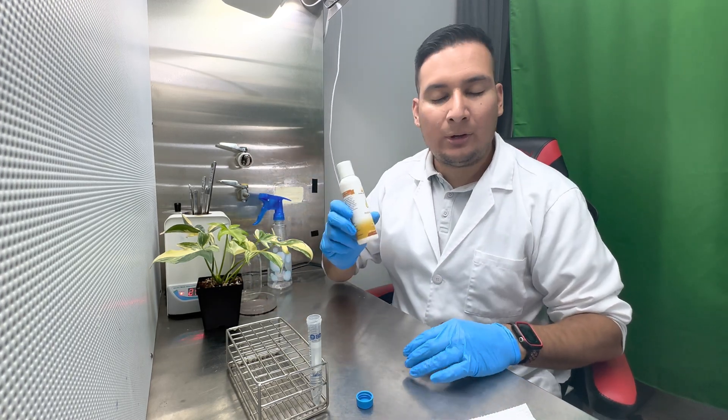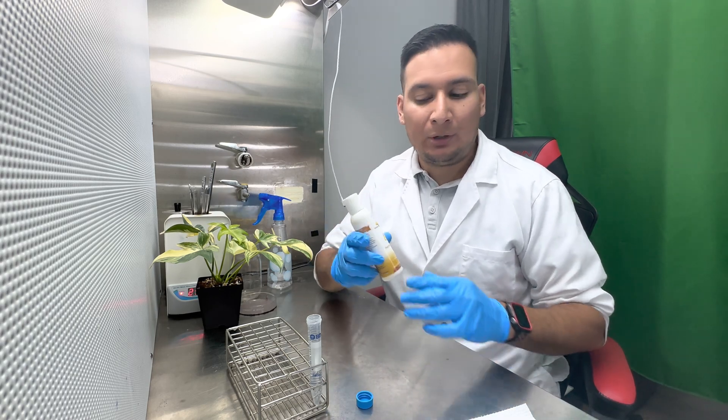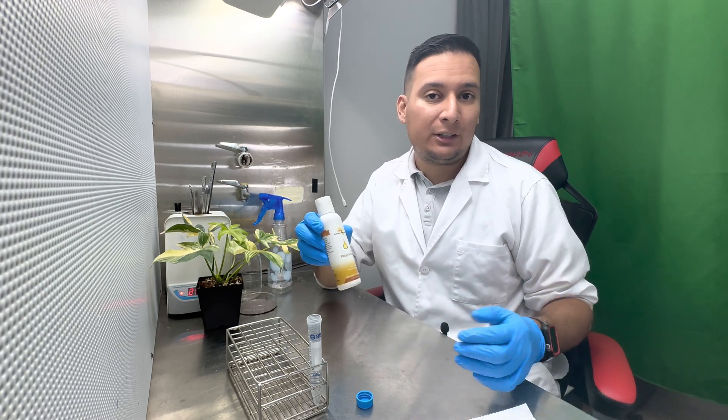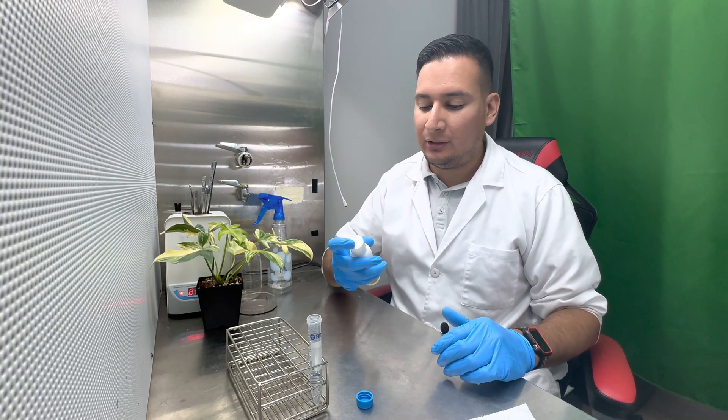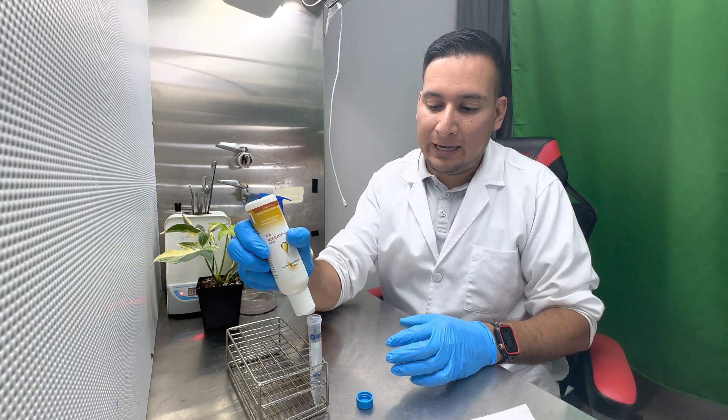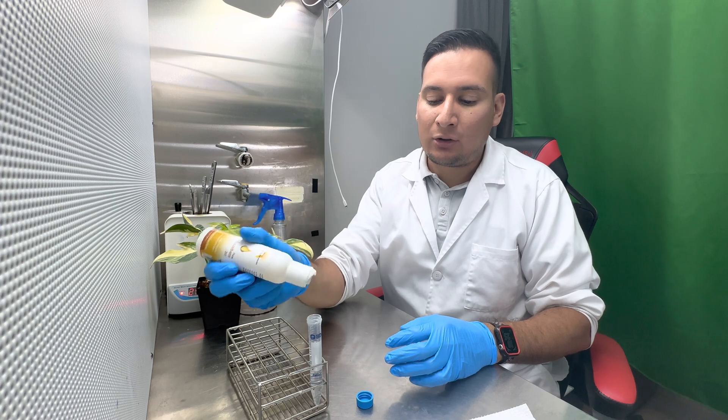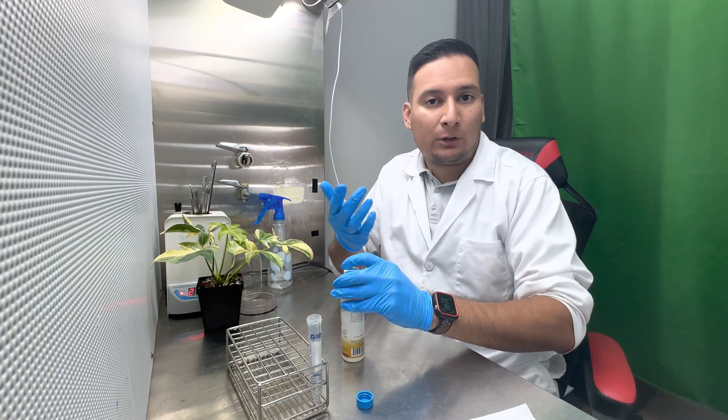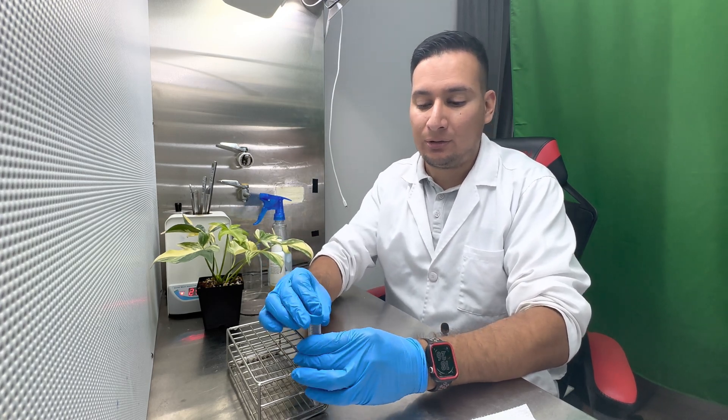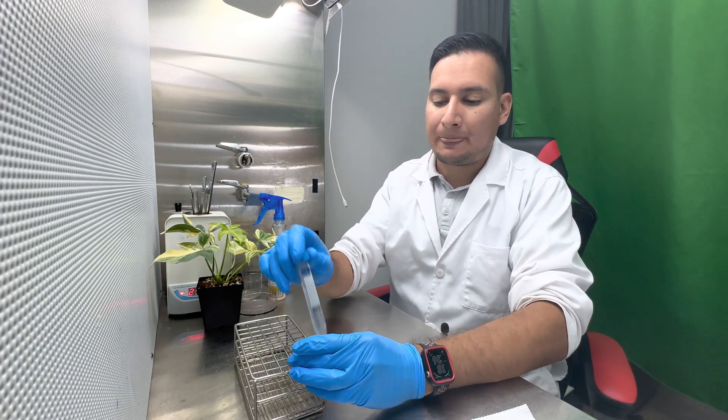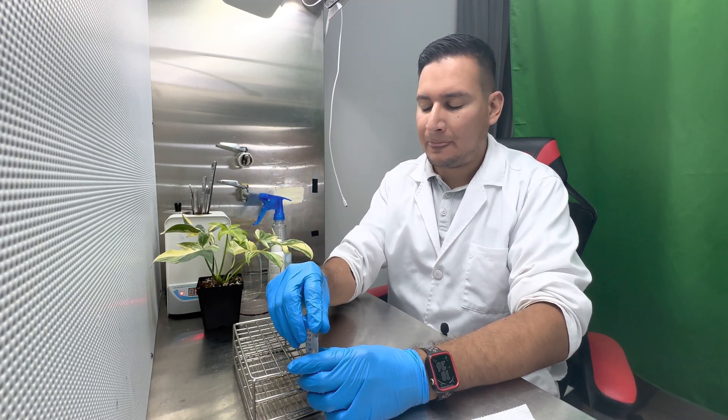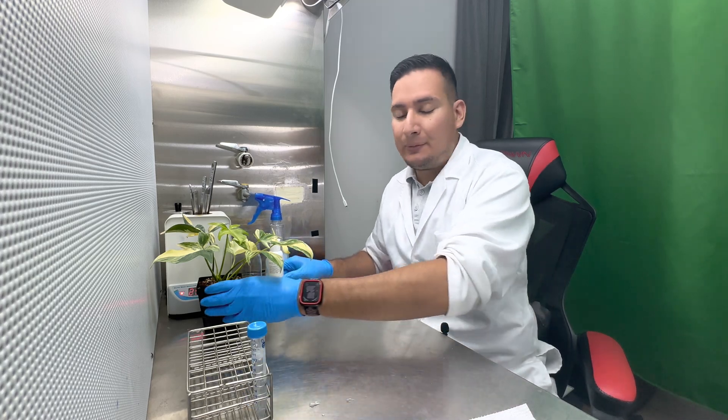Next I want to add a surfactant, this is polysorbate 20. You can also use Tween 20 or dish detergent if you don't have anything like this. The surfactant just makes the bleach have better contact with the surface of the plant so it's a better sterilizing solution. Now I'm ready to take the cutting from my plant.